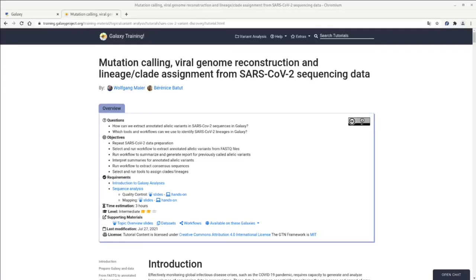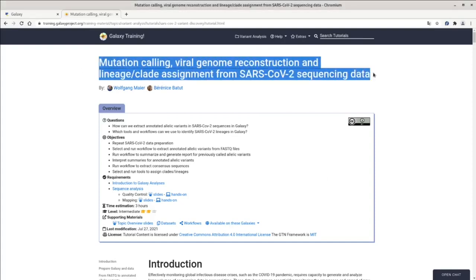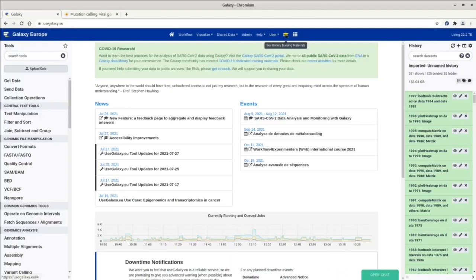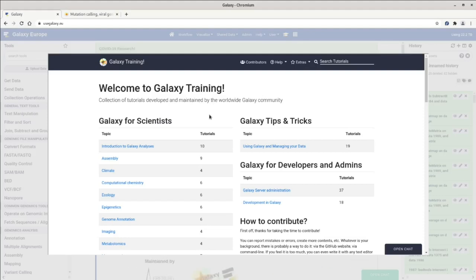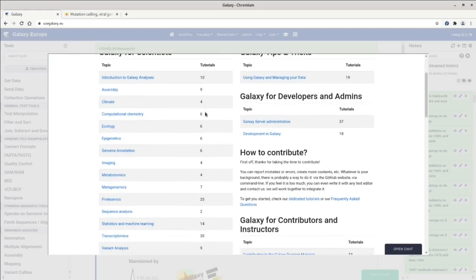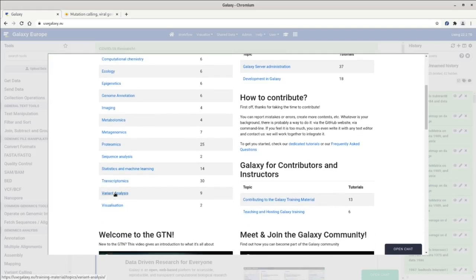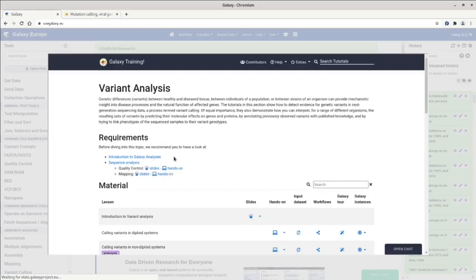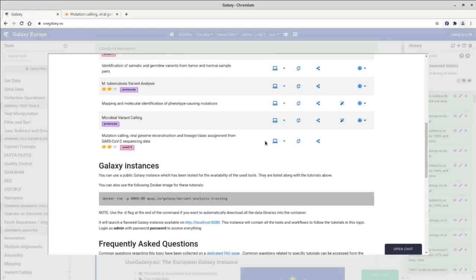In this video, I'm going to walk you through the tutorial 'Mutation calling, viral genome reconstruction and lineage clade assignment from SARS-CoV-2 sequencing data,' which is part of the Galaxy training material. You can follow this tutorial through the dedicated website training.galaxyproject.org, or from inside Galaxy by clicking on the little academic head icon, which brings up the training material site as well.